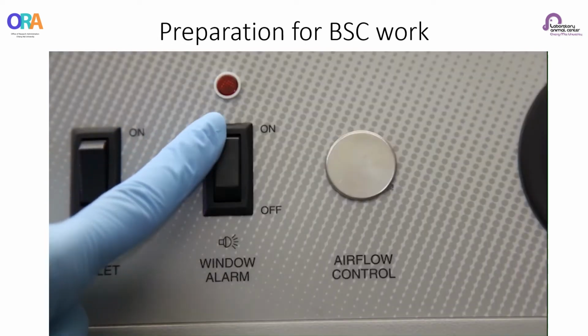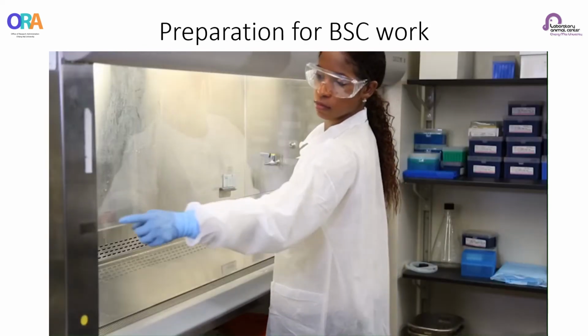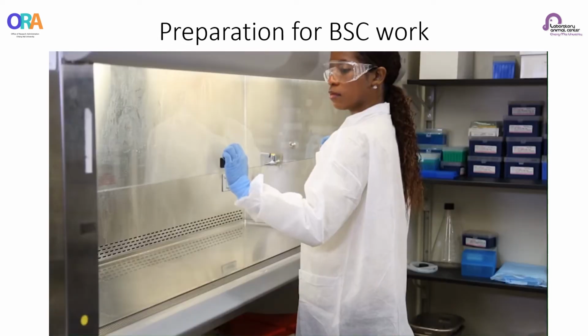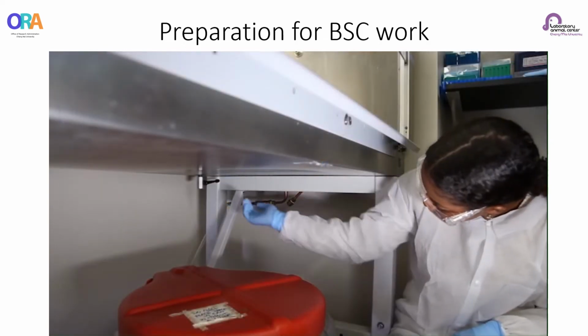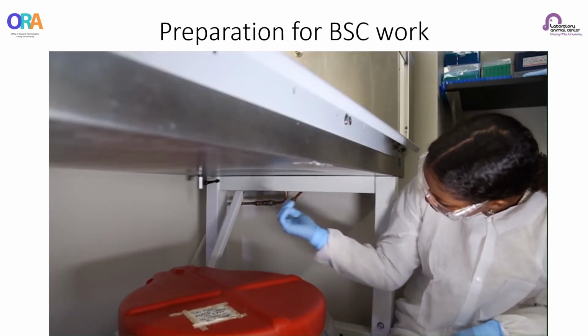Confirm that the alarm button is on, and open the sash and set it to the proper height, as noted on the outside wall of the BSC. The BSC sash alarm will sound if the sash is set too high. Next, make sure the drain valve handle is perpendicular to the valve body, indicating that it is closed.